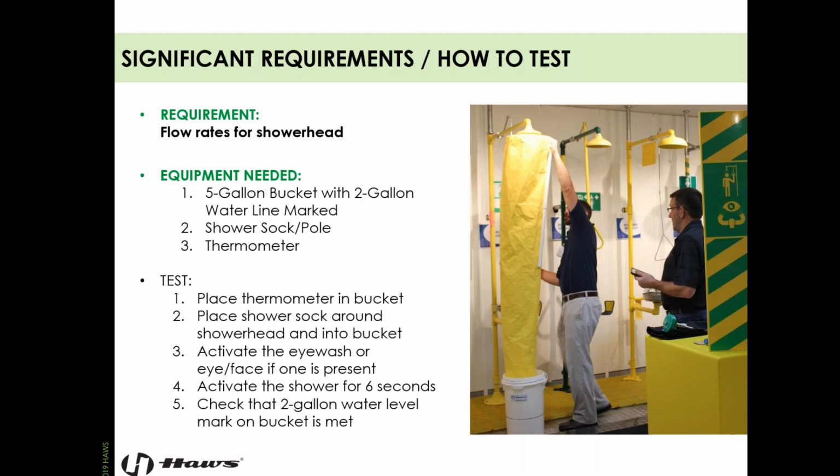Place the shower sock around the shower head and funnel it down into the bucket, or you're going to have some wet loafers. Activate the eyewash or the eye face wash if one is present. We want to make sure if it's a combination unit, then it is functioning correctly when it's being used as a combination unit, because that's its purpose.